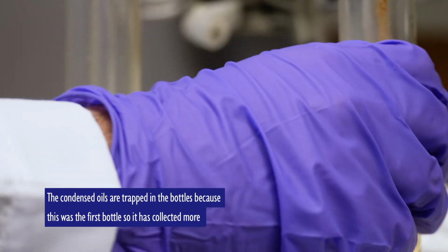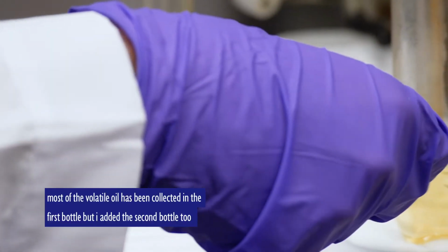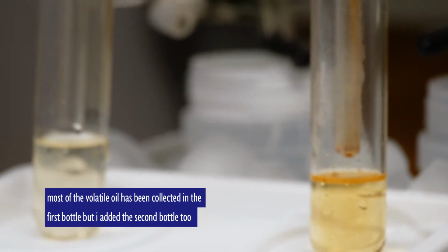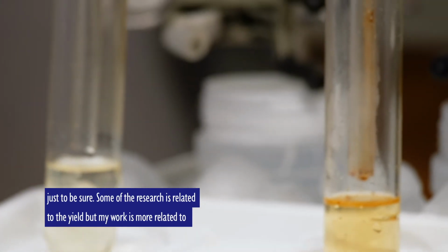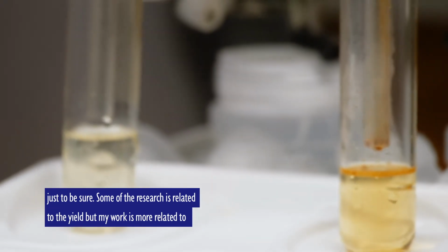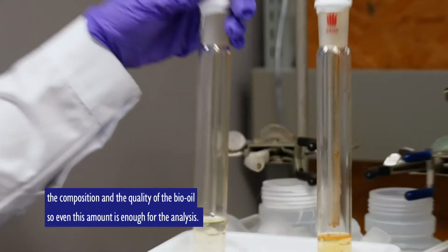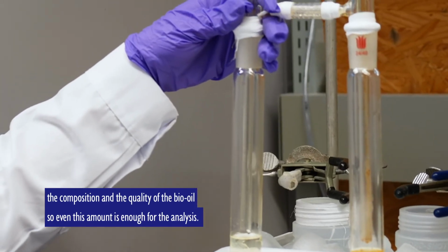Because this was the first bottle, it has collected more. Most of the volatiles have been collected in the first bottle. But I put the second bottle too, just to be sure. Some of the research is related to yield, but mine is more related to the composition and the quality of the bio oil, so even this amount is enough for the analysis.